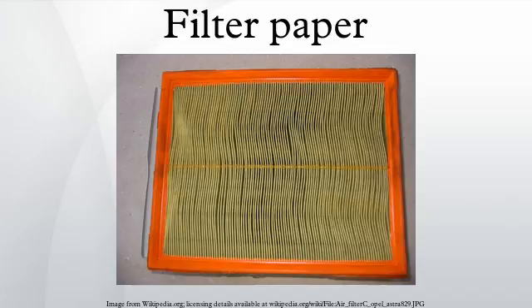Glass fiber filters. Glass fiber filter has the pore size of 1 micrometer. It is useful for filtering highly contaminated solutions or difficult to filter solutions. Also, glass fiber filter extends filter life, handles a wide range of particulate loads and can prevent sample contamination. In addition, different types of glass fiber filter are suitable for different filtration situations. There are 7 different types of glass fiber filters and the major difference is thickness.